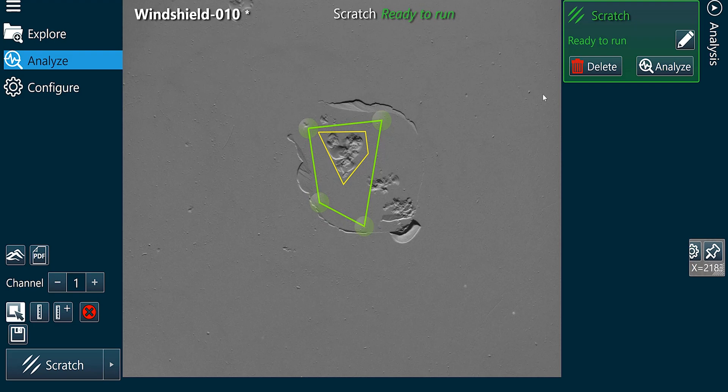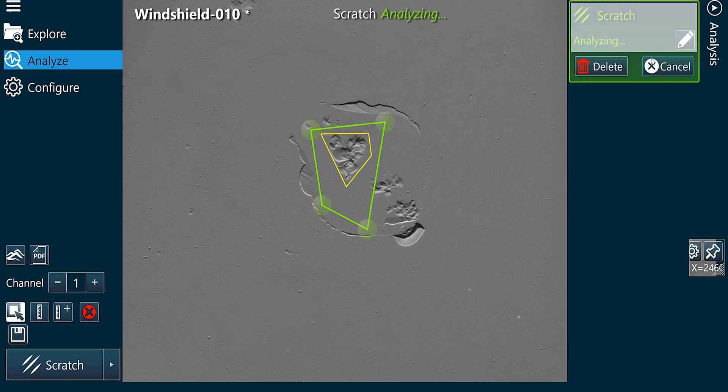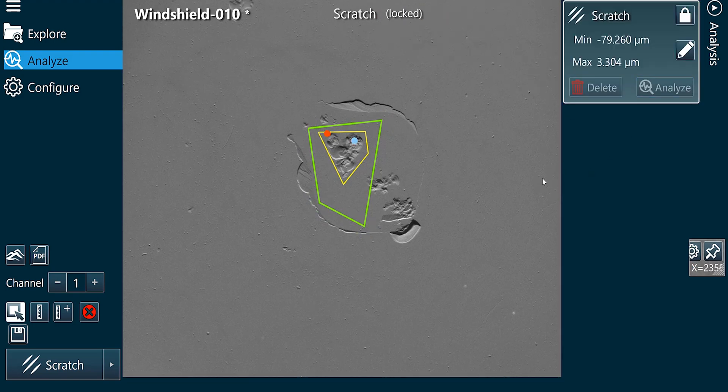The analysis output will be the minimum point within the scratch, represented by the blue dot, and the maximum point, represented by the red dot.